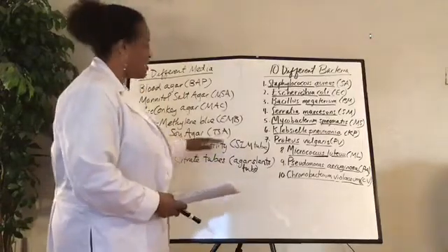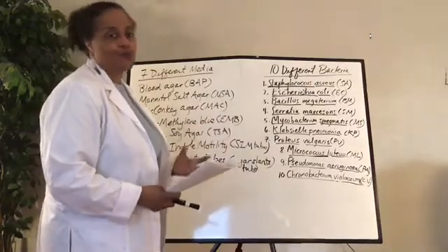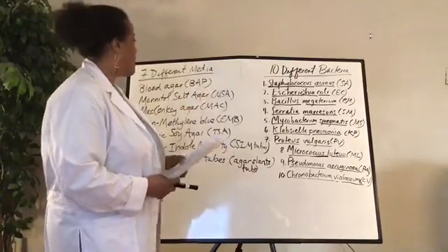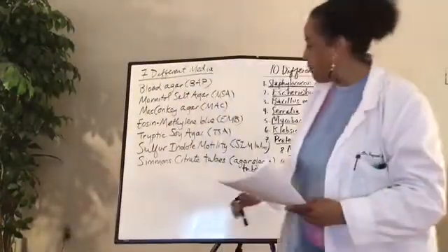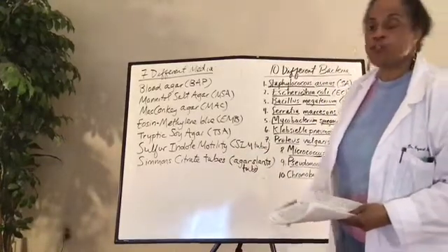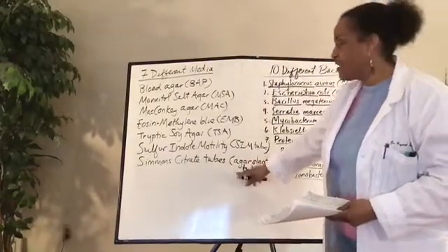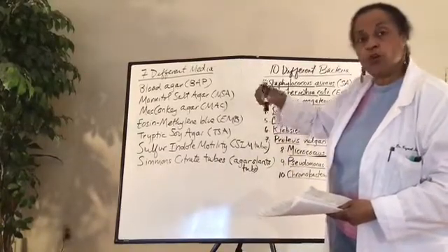And TSA, just about everything grows on TSA. So this is kind of a multi-cultural type of agar that really most organisms will grow on, as well as the blood agar plate. Remember for sulfur indole motility, the SIM tube, please remember to use a needle for this one to stab it into the tube and then bring it straight out. And for the citrate, use an agar slant, so you will start at the bottom and wiggle your way up.